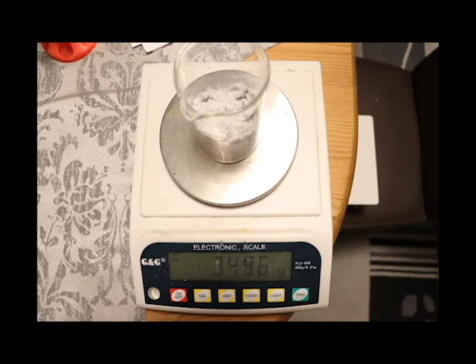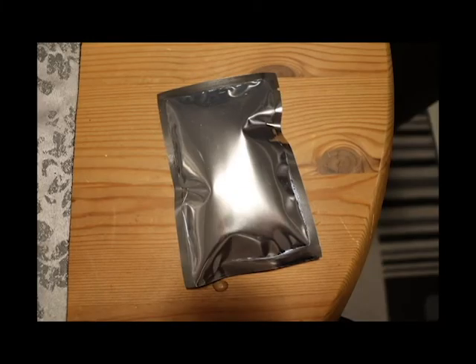This also matches up pretty well with the amount of water that we collected. We collected 13.3 grams of water, and the theoretical amount would be 14.29 grams. So a difference of about 1 gram. But as there's always some loss of water or solvents in general during distillation, this matches up pretty well. And it seems that we got the water out of the oxalic acid pretty well. To prevent the oxalic acid from getting hydrated again, it was vacuum sealed for better storage.